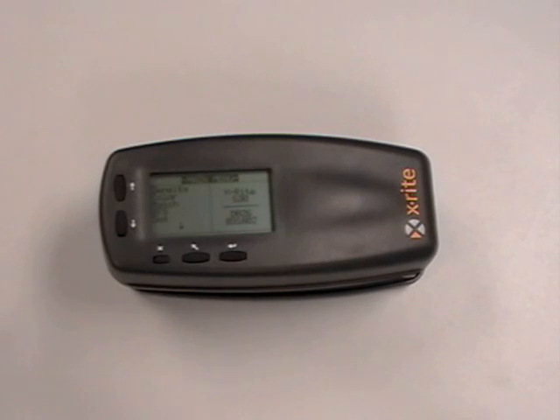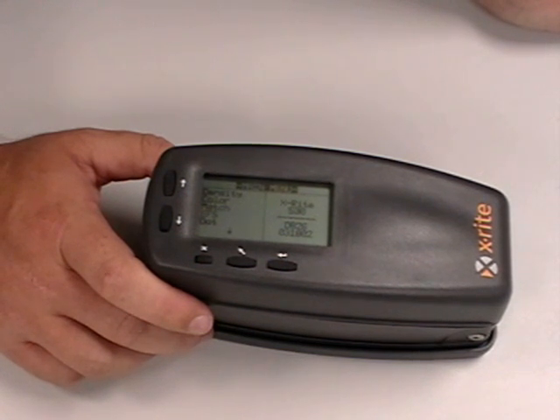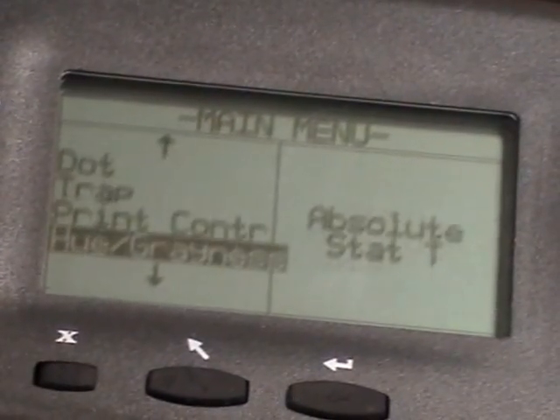Hello, this is Jason Hedgecock with the X-Rights Application Support Department. Today we're going to be discussing the 500 and full calibration. To do a 500 and full calibration, you'll scroll from the main menu down to Configuration.